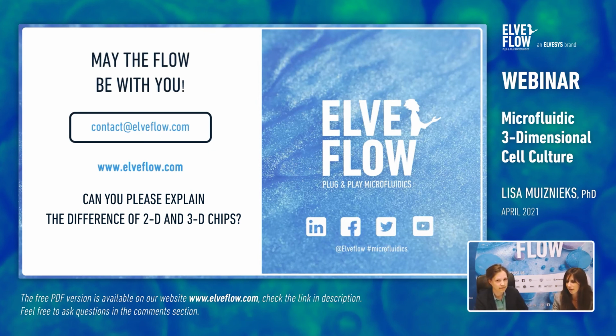Yeah, and also I can add just one point here. You can have also some 3D chips where you can have exactly 2 flows and the membrane in between, where you can grow a type of cell on one side and a type of cell on the other side. So you can really create a co-culture, so multi-layers, let's say, sample, I would say.